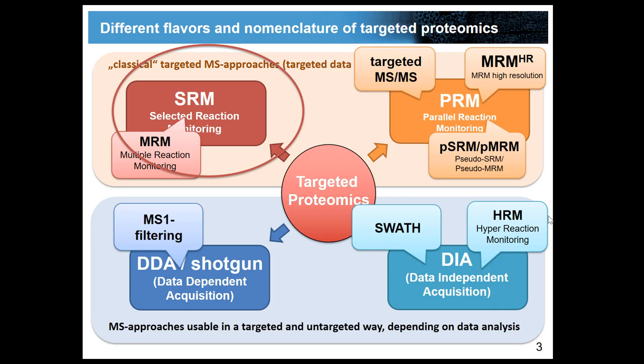All of these alternative names refer to exactly the same technique. The reason why we have them around is mainly due to trademarking issues. So vendors just trademark specific names to their instruments, and this is why we will also in the future have to live with all these different names for exactly the same thing. So I guess it's important that you're aware of it and that you know what are the same methods, what are the different methods, and what are the commonalities and differences. And I'm sure by the end of this week you will know all of that very well.